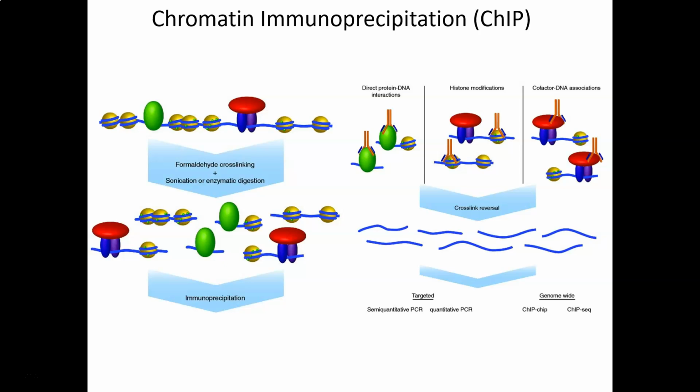We shear everything up with sonication. We add an antibody to ROX1, and we immunoprecipitate that antibody with protein A resin. Once we liberate the DNA from that immunoprecipitation, we've got AMB1 promoter in that tube. So now we add primers to the AMB1 promoter, and we ask the question, can these primers amplify anything? In other words, is the AMB1 promoter in this tube as template?